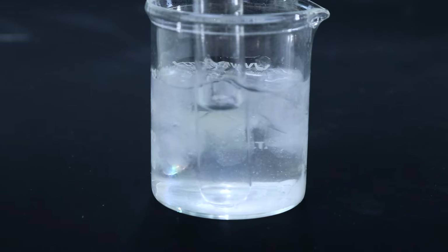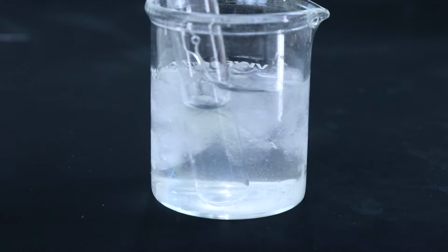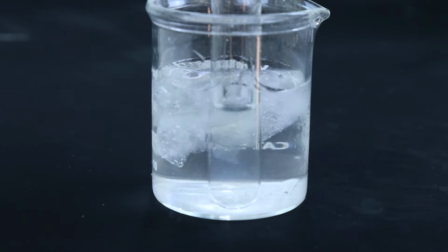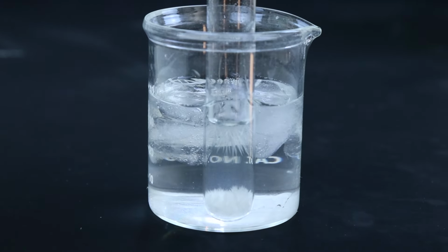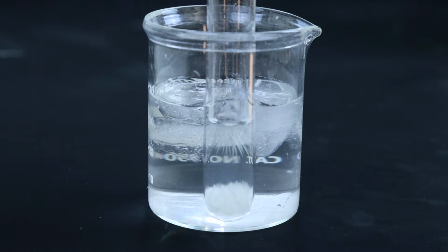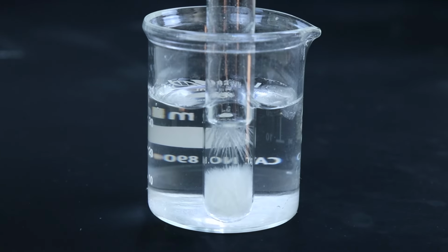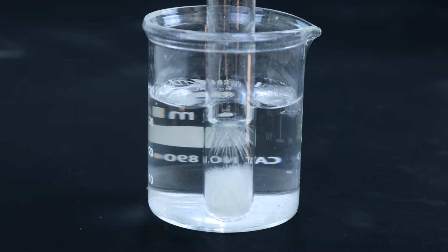After moving it around for just a little bit, nothing happened, so I'm going to leave it in there for a few minutes now just to see if anything does change. It's kind of hard to see, but after about 5 minutes, some crystals started forming at the bottom and at the top, and eventually started recrystallizing really nicely. After the solid has completely formed, there's actually not going to be any need to recrystallize this acid because it already did that, coming out of the water solution slowly. These crystals should be pretty pure.